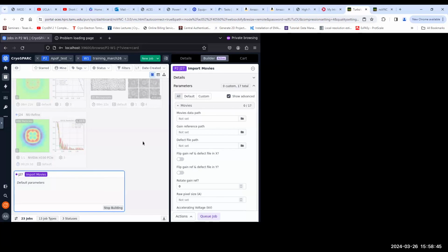Yeah, okay. That's something we might need because the reconstructions are typically done with symmetry applied. But there's one feature that may not have any symmetry. So I want to take that bit out and then redo it without any symmetry and see what it looks like. Yeah, as long as it's not very small. If it is very small, then it might have a hard time to align. But if it's not very small, then it should be okay. I think we're still looking at a feature which is several nanometers in size. Then it should be okay. Yeah, okay.